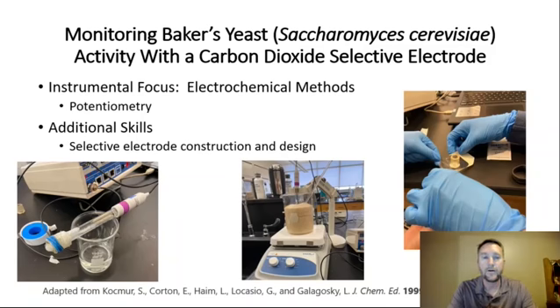production of Baker's yeast. And so you can see here the final product, for example, for that carbon dioxide selective electrode. These are student hands in there as they were constructing that. So they have a piece of Tegaderm that we use as the gas permeable membrane in this experiment when they're getting ready to cover their pH electrodes. That's what we modified in order to make this work.